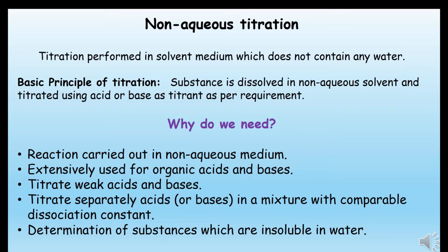So what is non-aqueous titration? Non-aqueous titration is a titration which is performed in the absence of an aqueous medium, or water. So the solvent used in non-aqueous titration is anything other than water.